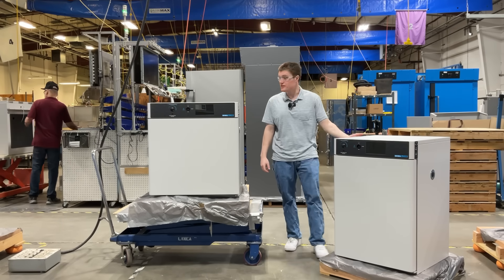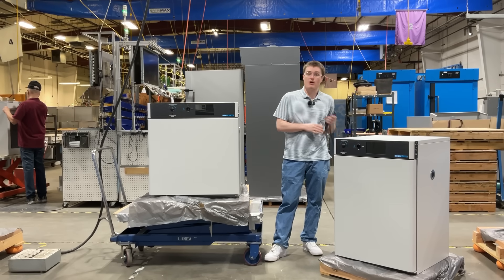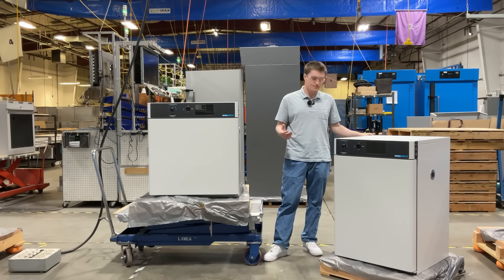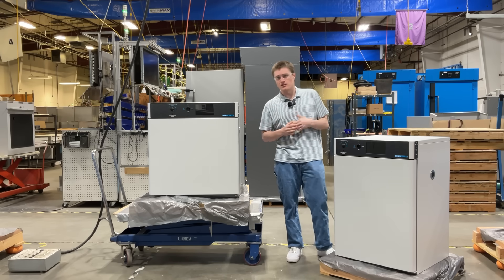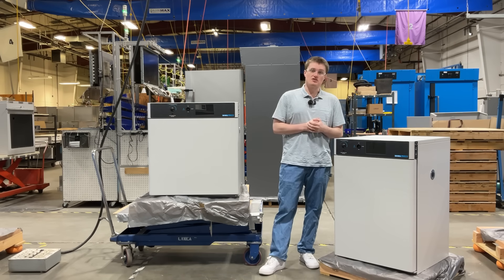Located on the right side of both of these units is the power inlet. These units have a power cord included, and they must be connected to a properly grounded electrical outlet. For details related to further electrical safety as well as installation requirements, please visit our user manual.